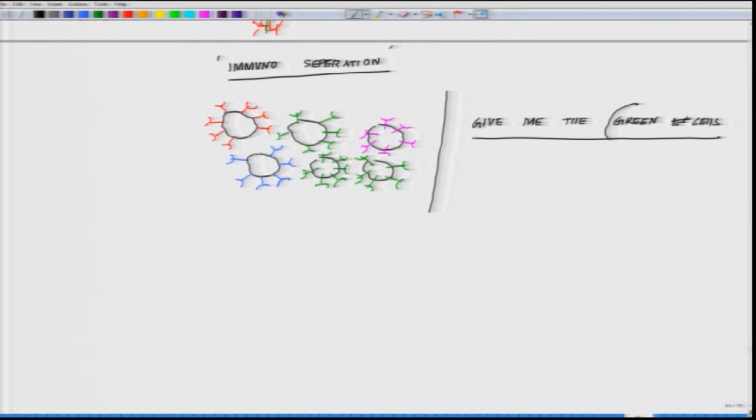And I believe these green cells are, say, motor neurons. And this process in development may be a very unique phase. So, I know that say at E14 motor neuron expresses this receptor, but by E16 or E17 there will again be a mix and match.